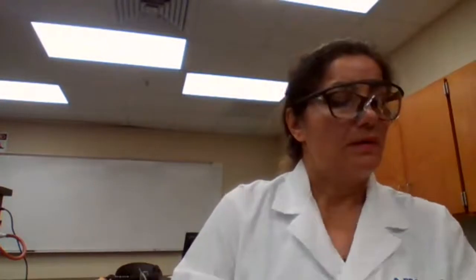Central Campus Chemistry 1046 Lab, Experiment 3. This is Experiment 3, Chemical Kinetics 2, the rate affected by different factors that affect the rate of the reaction. I'm going to share with you the document. We talk about this document.